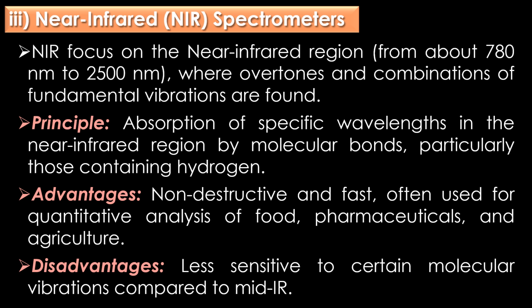Advantages: this technique is non-destructive and fast, often used for quantitative analysis of food, pharmaceuticals, and agriculture. Disadvantages: this technique is less sensitive to certain molecular vibrations when compared to mid-IR.